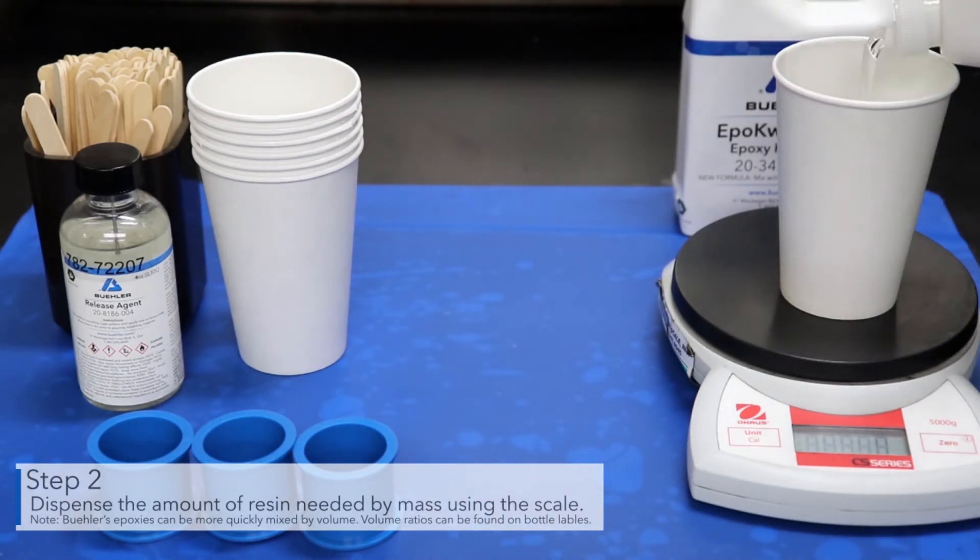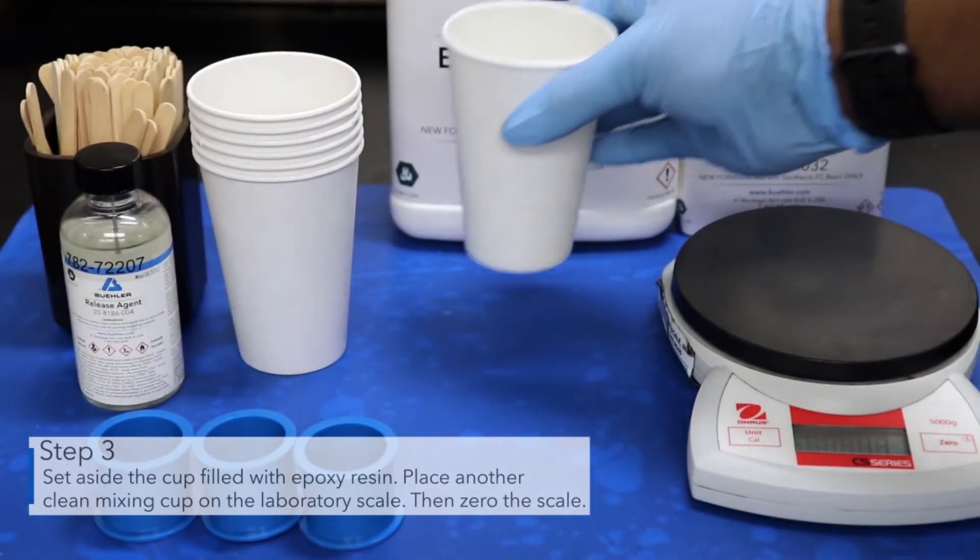Buehler epoxies can be more quickly mixed by volume. Volume ratios can be found on bottle labels. Set aside the cup filled with epoxy resin.